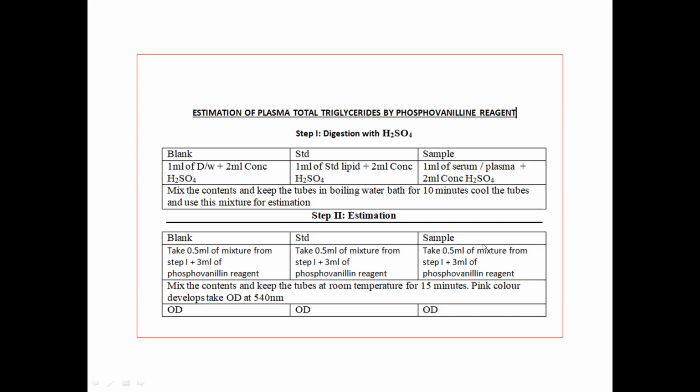Now you will have to imagine the regular practical. Those who were there will recall it better. After that, you will be keeping it at room temperature for 15 minutes. A pink color will develop. You have to take the OD at 540 nanometer.